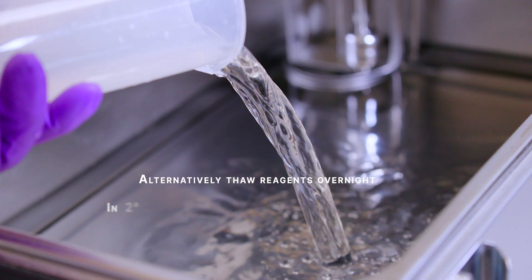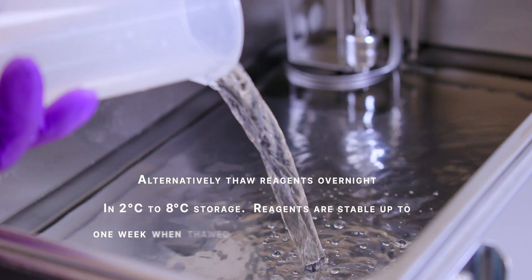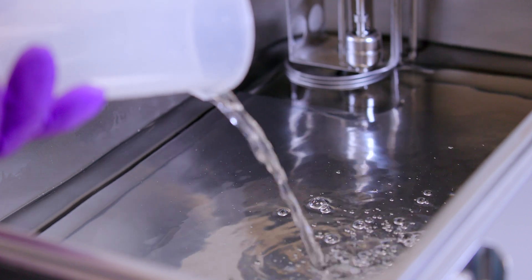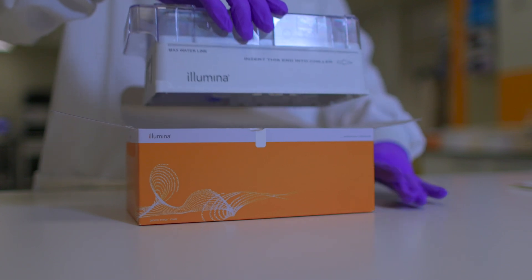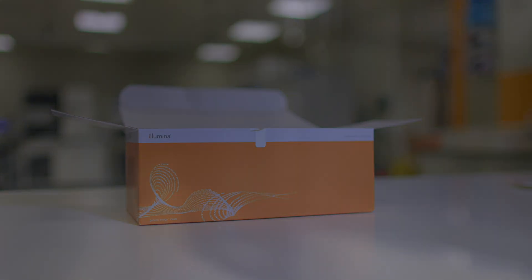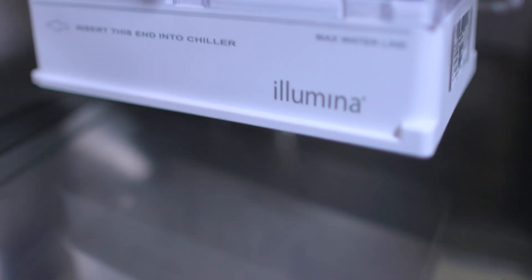To thaw the cartridge, prepare a water bath containing enough room temperature deionised water to submerge the base of the reagent cartridge. Place the cartridge in the water bath.